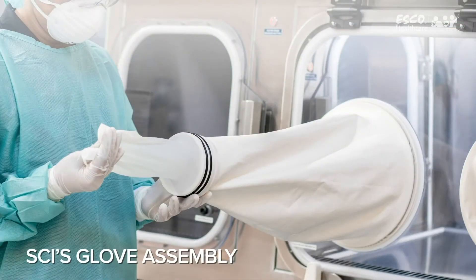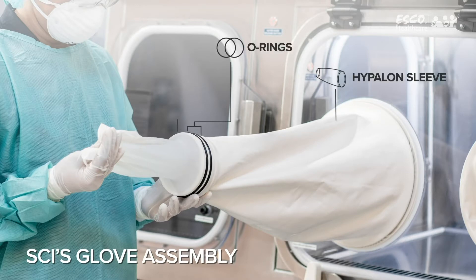The glove assembly is composed of the following materials: the Hypolin sleeve, the O-rings, the cuff rings, and the gloves.